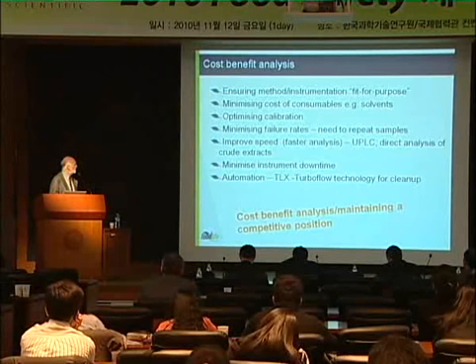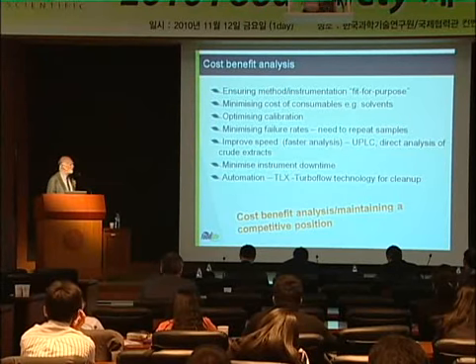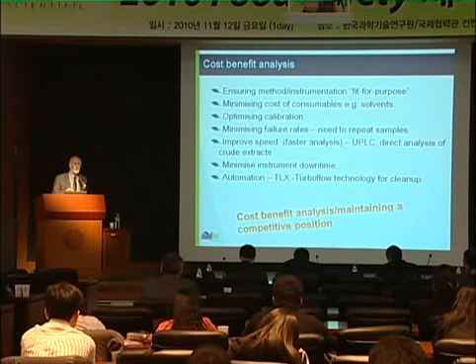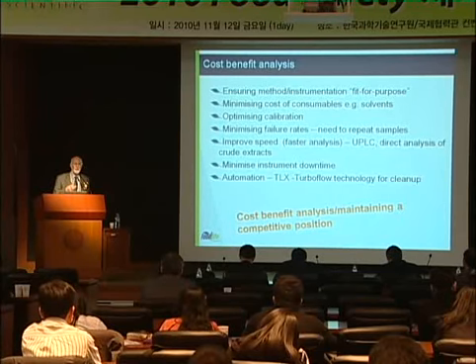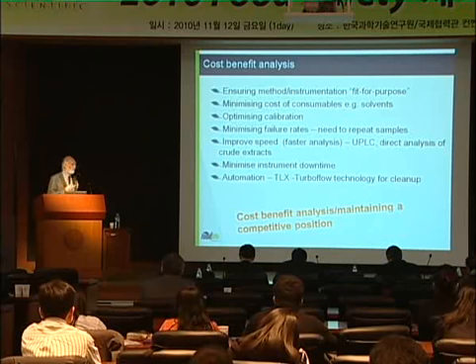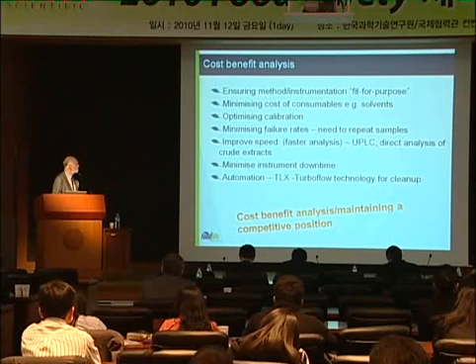Looking closely at failure rates in the laboratory, sometimes you find that batches of samples are failing repeatedly because they're not meeting quality standards. Every time a batch of samples fails, it means the cost of doing that analysis has been totally wasted. You can't charge the customers for sample batches that fail. So very low failure rates are really important in maintaining efficiency.